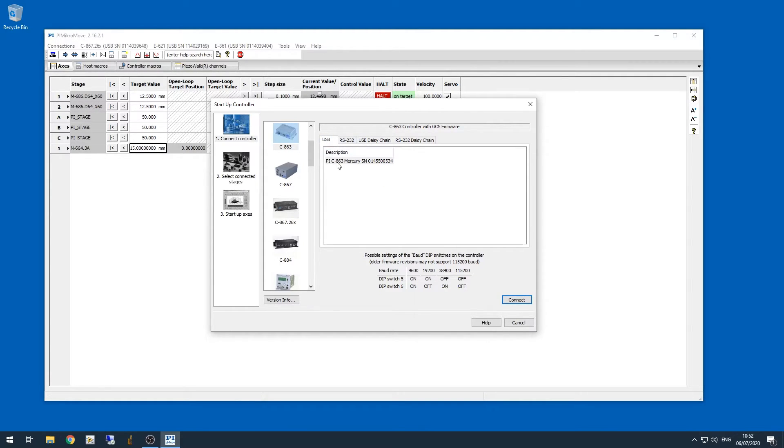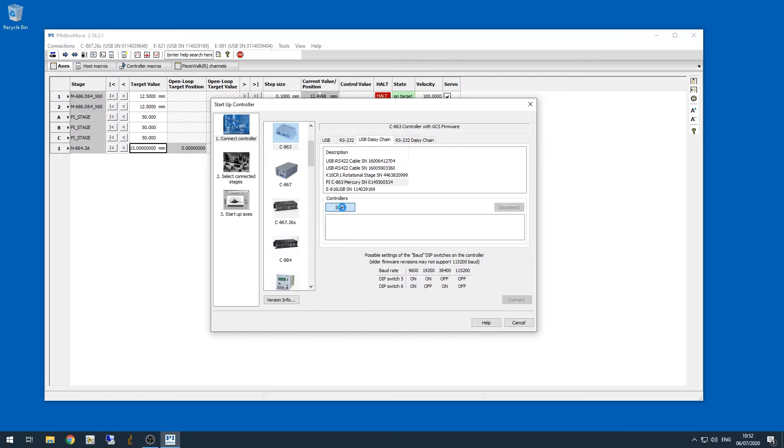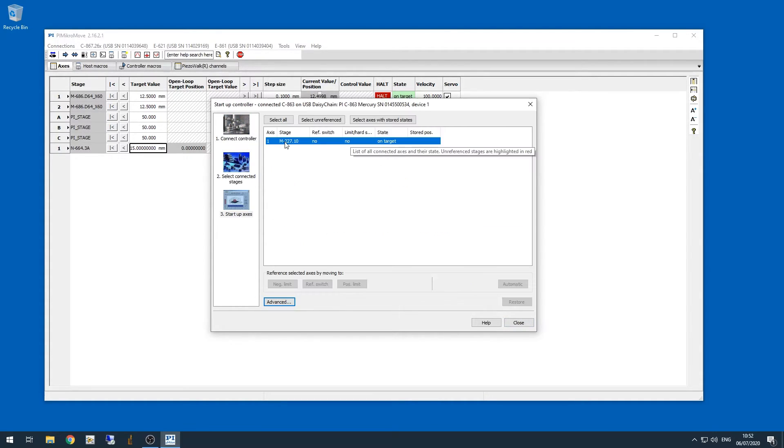Now initially you'll be on the USB tab, but we need to go onto the USB daisy chain tab, and then select the C863 and click the scan button. Now it should find all three motors, so I'm going to choose the first motor and click connect.